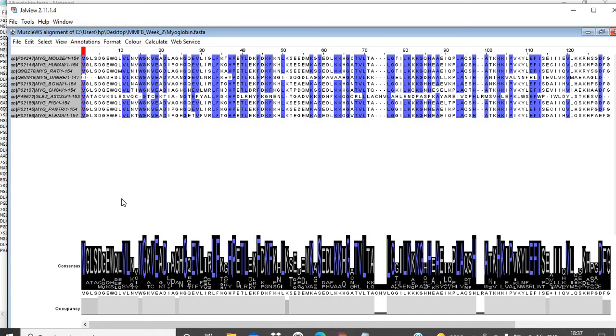So that's why the V is here, it has been highlighted. Here it is L. The leucine is also most prevalent. So L is 90%. The residue which has the highest frequency will be highlighted, and it will have a larger size of the letter.